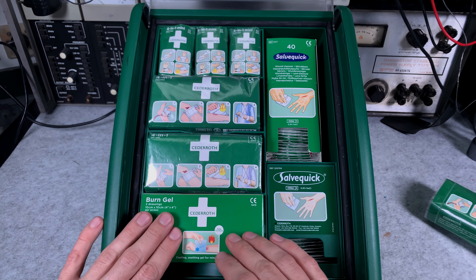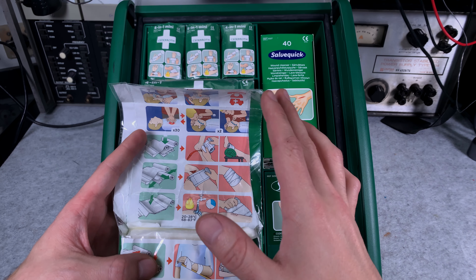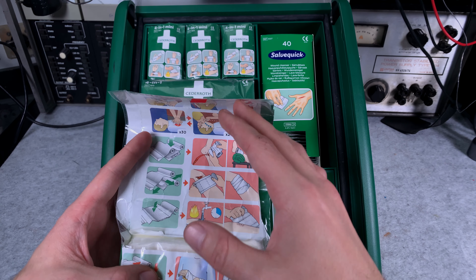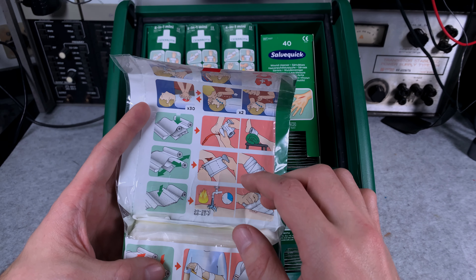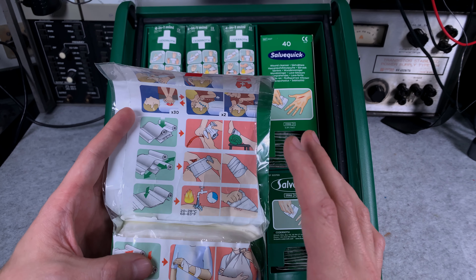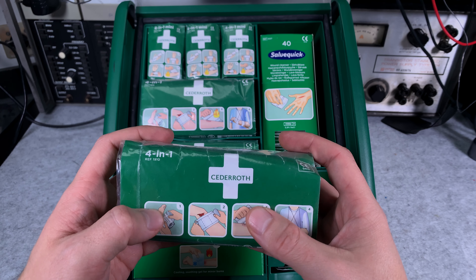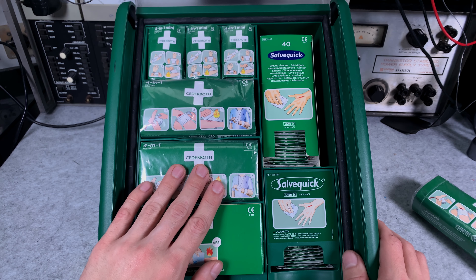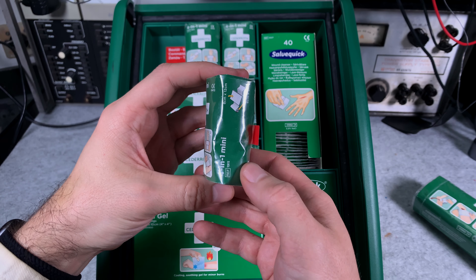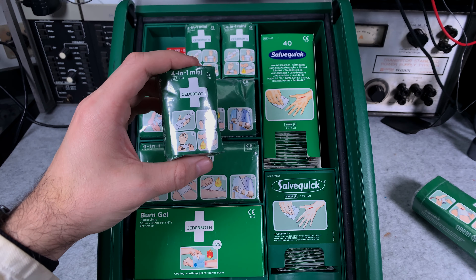Those four-in-one remind me very much of Israeli combat gauze — they are totally different and for the civilian market, but a little bit similar because you've got a roll of gauze and you can use it to create pressure or apply a wound dressing, so it's pretty universal. I highly recommend you check their page because they show you how to apply it really well. You've got two spots to place them, and here you've got a mini dressing for small cuts on your finger — something bigger than just a band-aid.